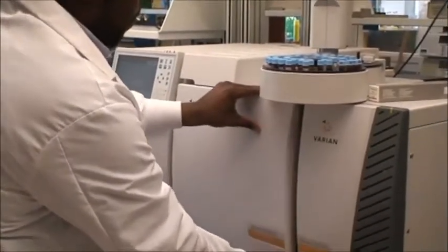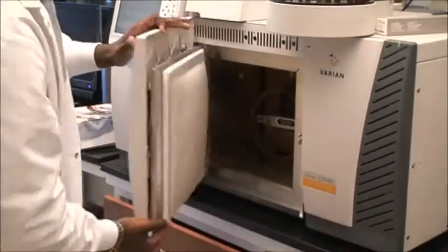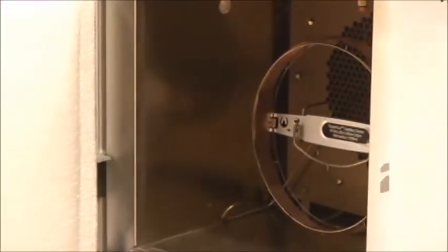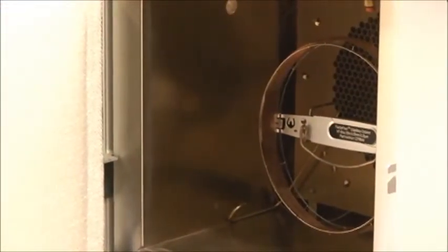If you look in the oven, we'll actually see the capillary tube. And this is what is used to push the sample through. The longer the tube, the better the separation.